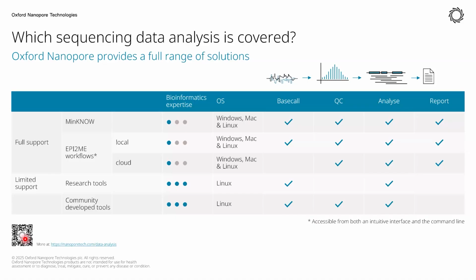If you're looking at human variation, it's going to look at all those different ways of assessing variance. So EPI2ME. Okay, thank you. Yeah, EPI2ME is probably what you're thinking, and we'll talk about that in a little bit. And if we don't cover it, then just let me know, and we can discuss it more. Okay.